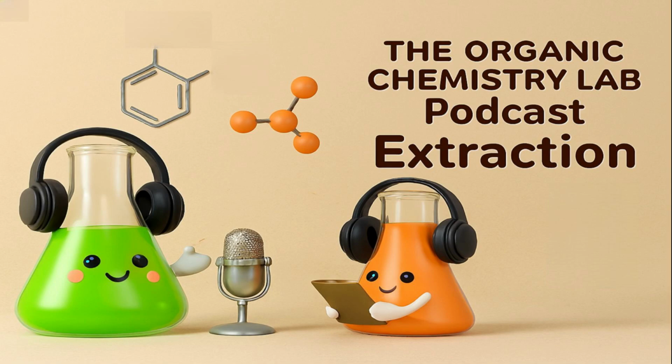Welcome everyone to this session, Caffeine's Great Escape, the Invisible Forces of Extraction. Today we will explore one of chemistry's most fascinating tricks, how we separate molecules at the microscopic level. Extraction may look simple in the lab, but behind it lies a story of molecular choice and preference. To make this concrete, we will follow caffeine, a molecule that most of us encounter every morning in coffee or tea, as it makes its great escape from water into an organic solvent.